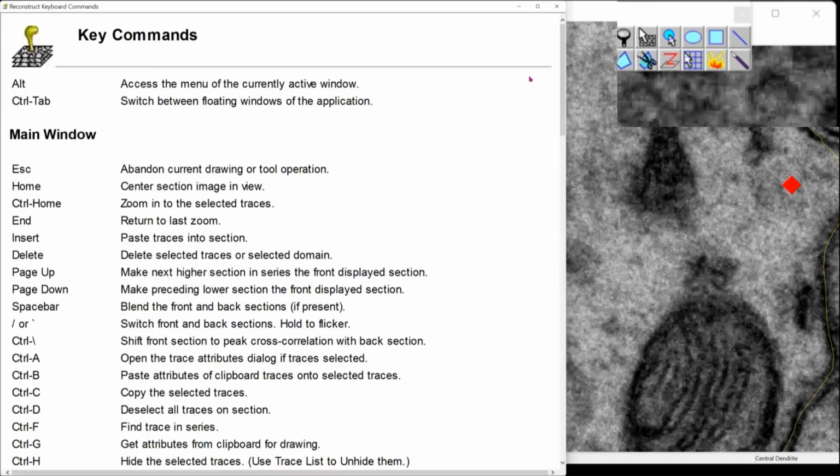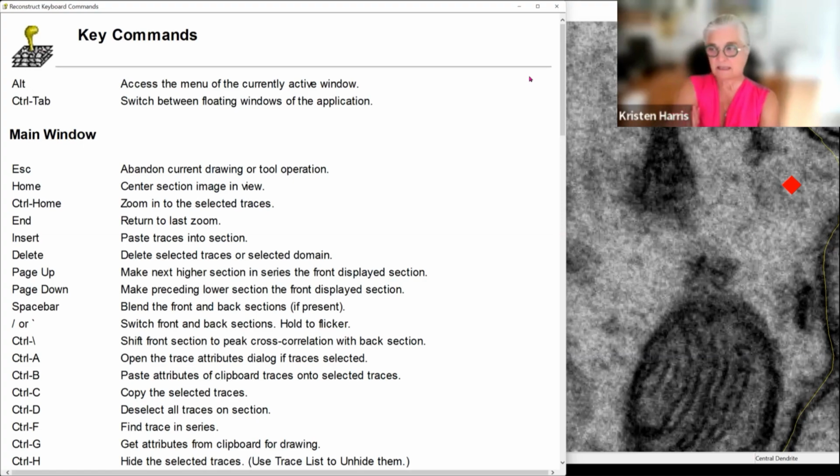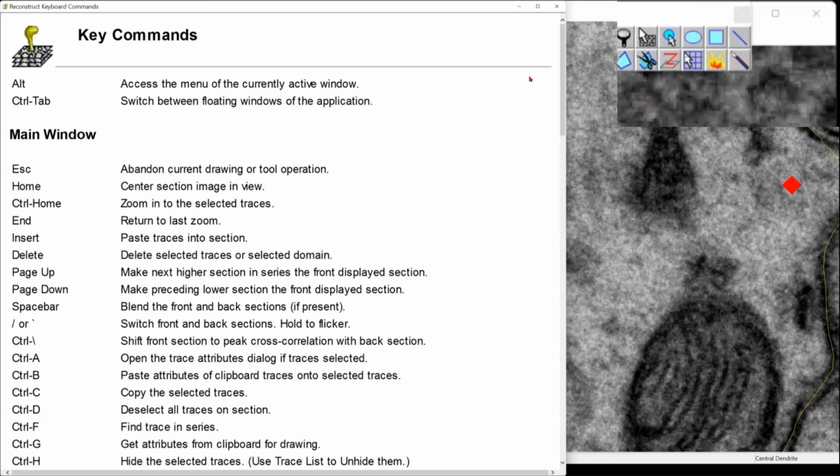Yeah. And I'm thinking in the future, at some point, you could have multi-user collaborations in which the stamps will get placed without the user's explicit typing. That's right. And I think that's how C3 Deep works too. I'm not sure if anybody else has used that in Mark Ellisman's group. He's looked at it. I think Andrea as well at some point.